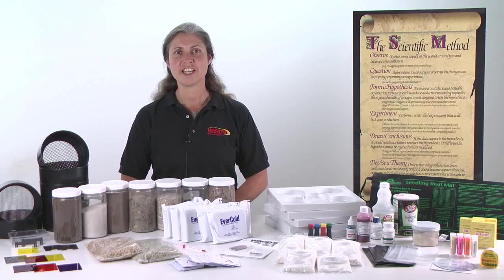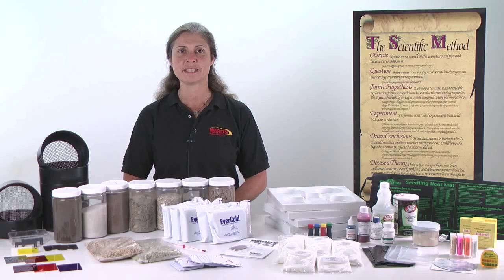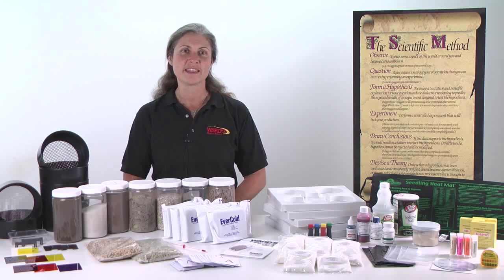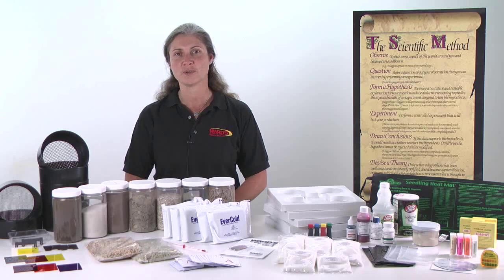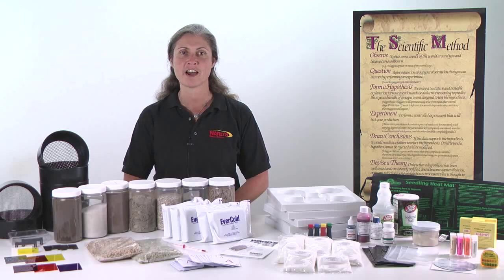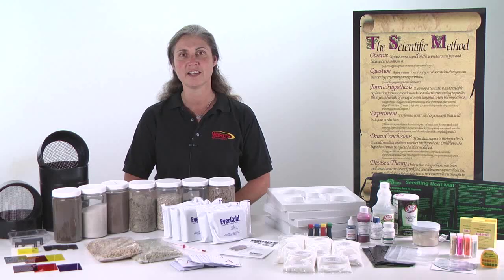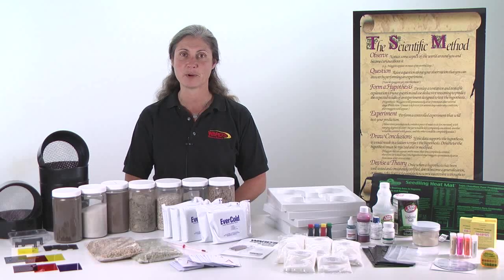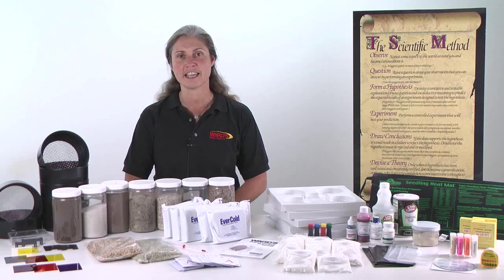Your AP Biology Inquiry Toolbox includes many items that will spark student curiosity about various parameters of systems under investigation in AP Biology. With this single kit, you can transition your classic style AP Biology labs to accommodate the new AP Biology lab standards set forth by the College Entrance Examination Board. Further, you can expand the Ward's AP Biology investigations that correlate with the new AP Biology lab curriculum topics and enable your students to investigate variables beyond the kit components.